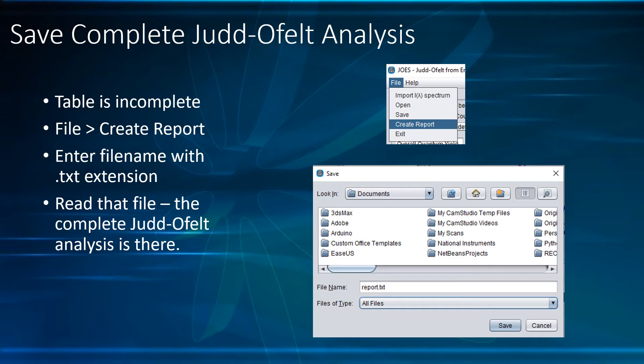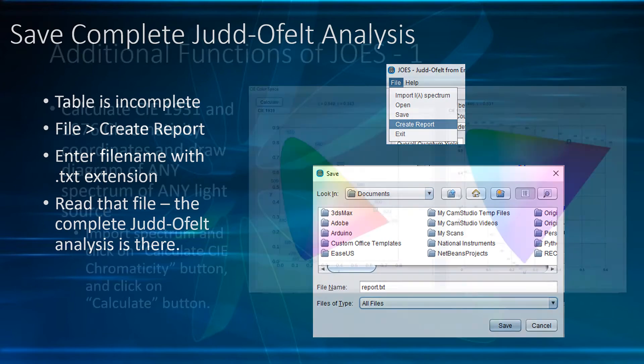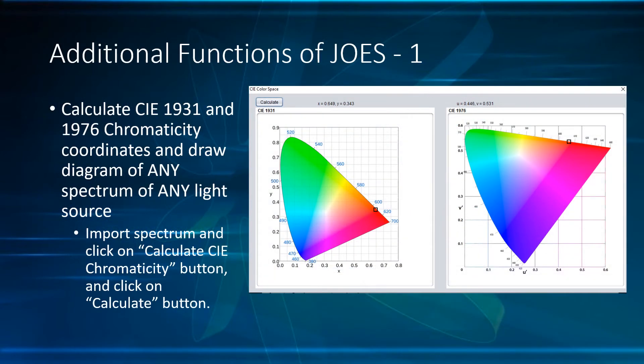The program has some additional features. The first one is the Chromaticity Analysis. It can calculate CIE coordinates and draw diagrams from the spectrum of any light source, not just Europium.